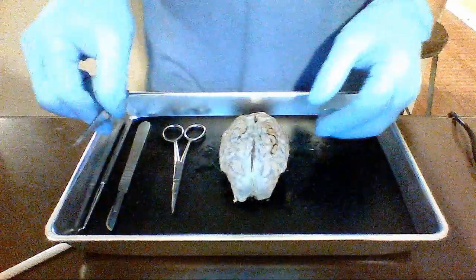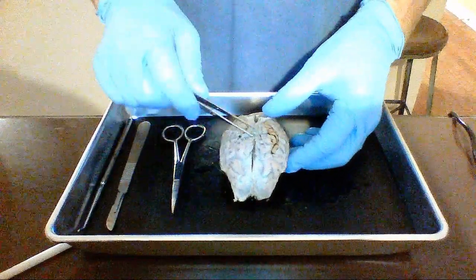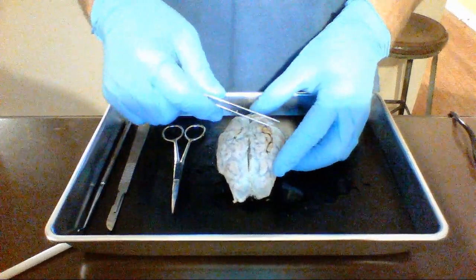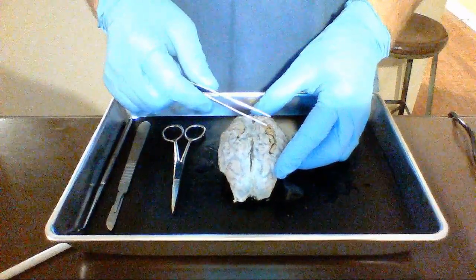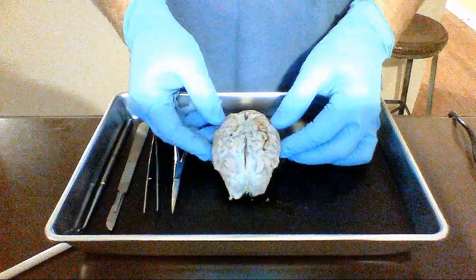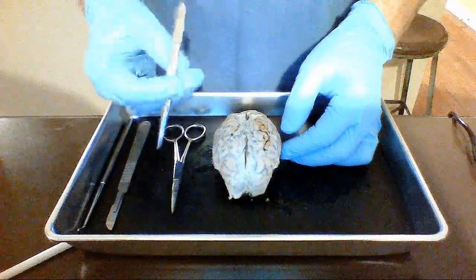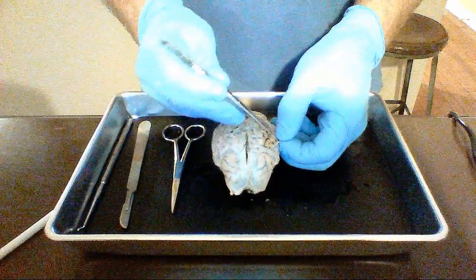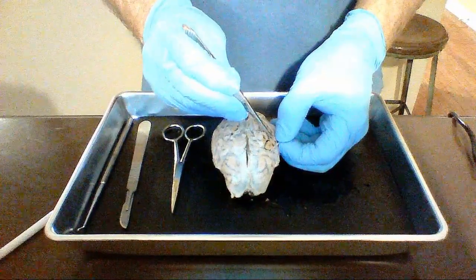So the thickest part is the dura mater, and that is what you can see here. That's really strong, very fibrous. And then your middle layer that you can't see here is the arachnoid layer, lots of space. And then there is a very thin layer on the outside of your brain that you can peel off with your forceps called the pia mater as well. So that pia mater is right there, really thin.